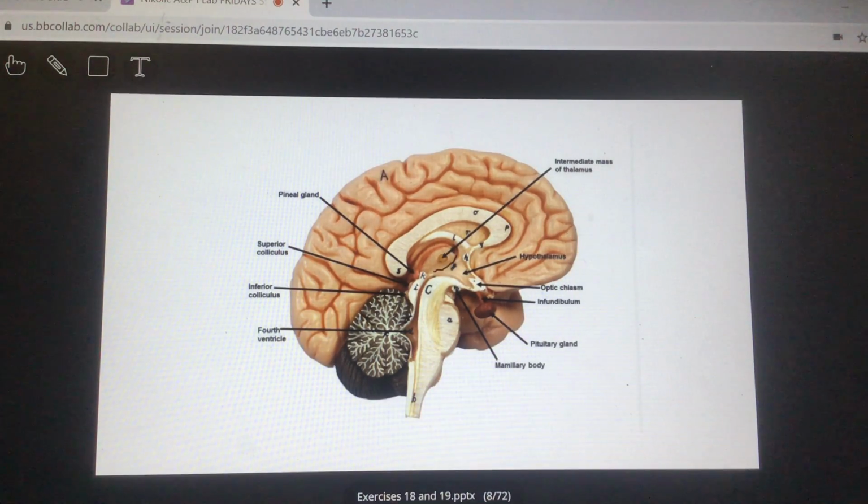So they could go underneath the thalamus or on top of the thalamus. Why? Because the third ventricle is a space that surrounds the thalamus, which makes it a little bit janky. So when we see the sheep model, there's actually a really nice groove that gives you a much better view of that. So again, basically anywhere around the thalamus, we could ask for that.